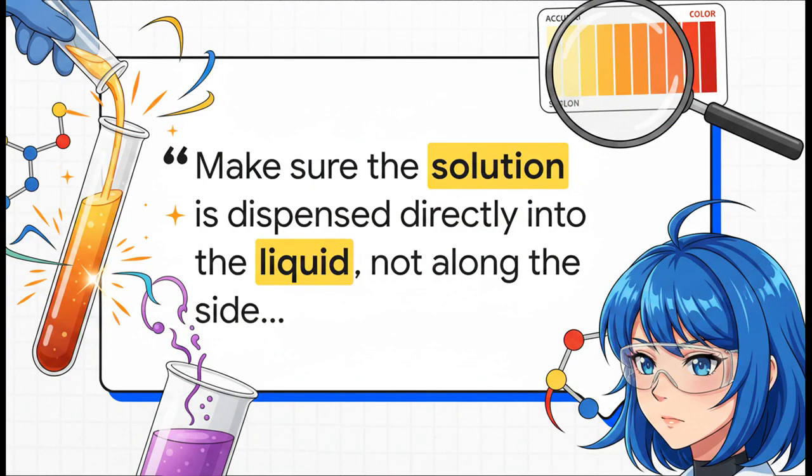Listen closely, because I cannot emphasize this next point enough. When you are adding that concentrated sulfuric acid, you must add it rapidly and directly into the liquid stream. Do not, I repeat, do not let it just dribble slowly down the side of the test tube.